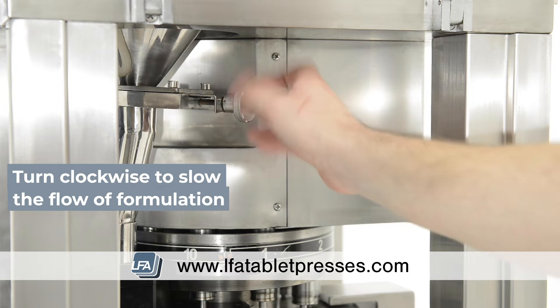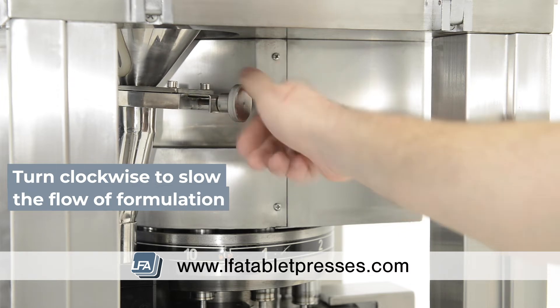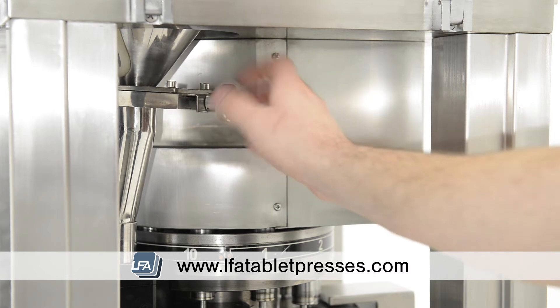Turning this adjuster clockwise will close and slow the flow of formulation going to the force feeder. If completely tightened, it will stop the flow of formulation. This is useful if you need to remove the hopper to make adjustments or repairs.